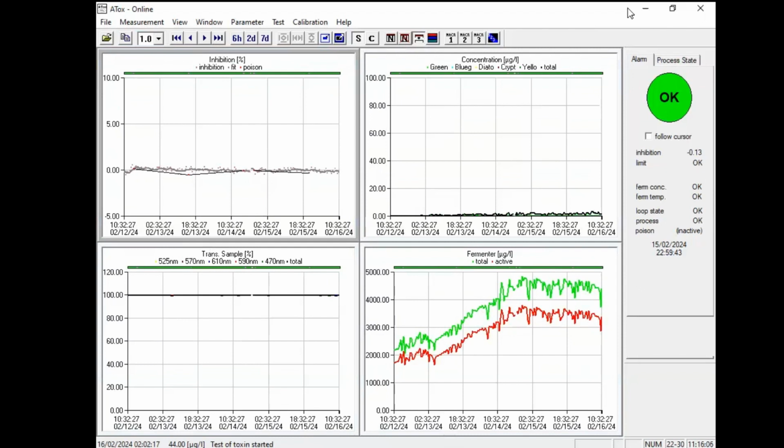I've got some questions. May I ask some questions? Yeah, please. First about this cleaning of the chlorophyll sensor. Is it cleaned with a piston mechanically, or by air pressure, or both of them?